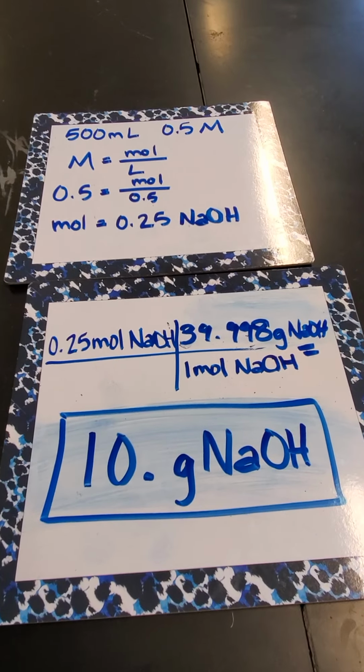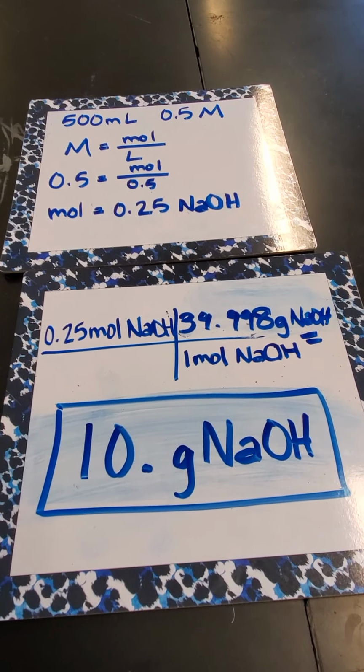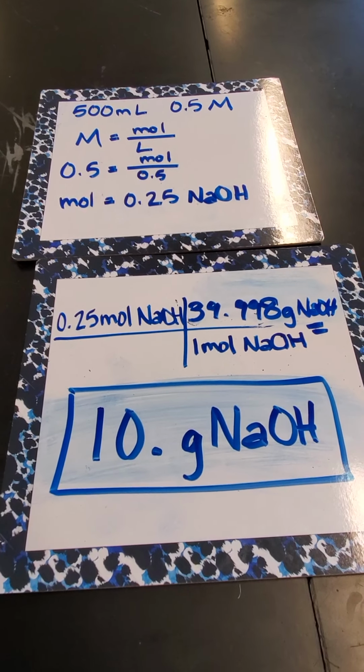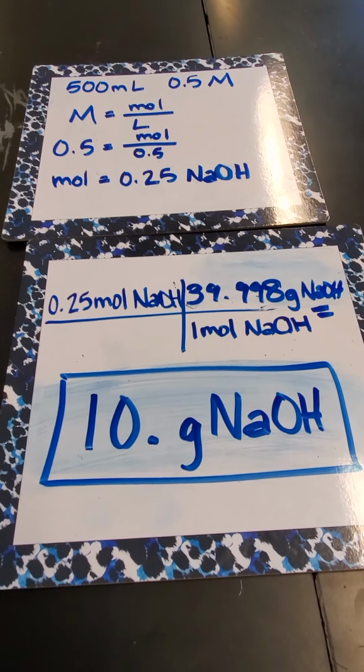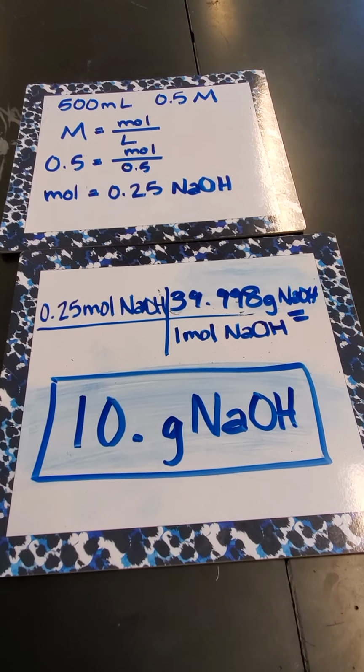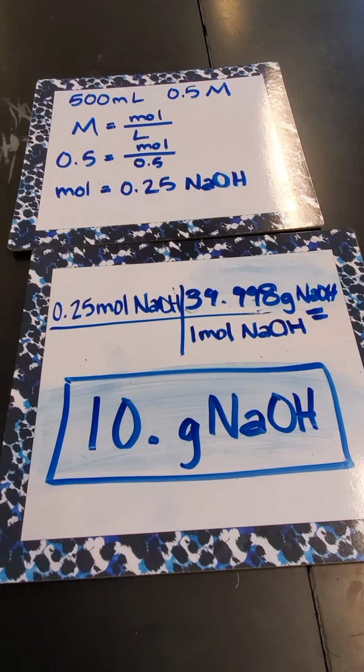Okay, give you one more look at that calculation. Went from the molar quantity and our amount of milliliters, and I was able to convert to figure out how many grams of solute I would need to add to my solvent.